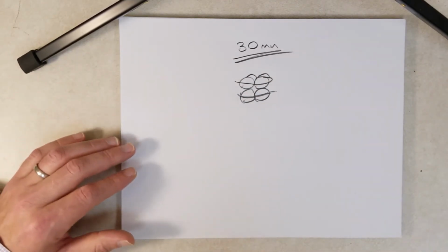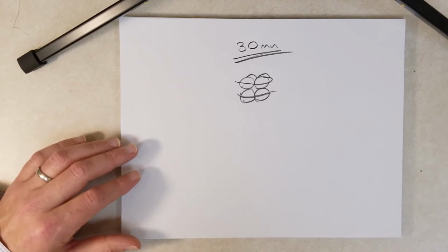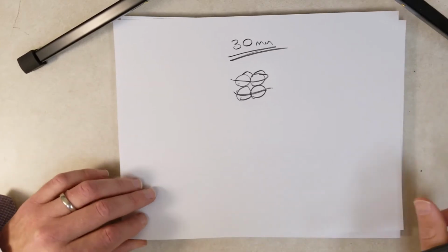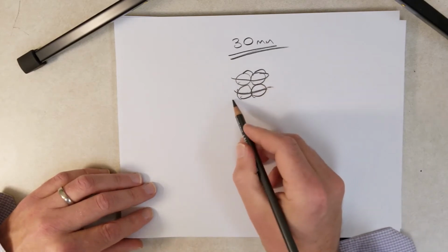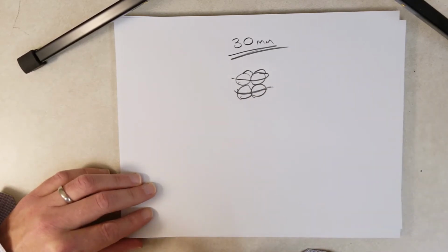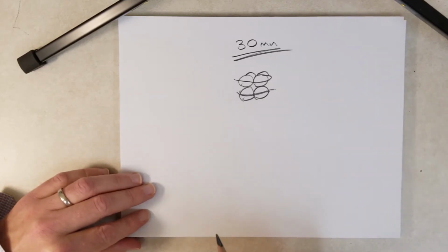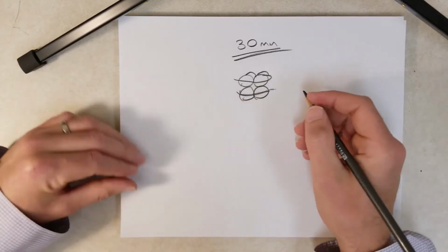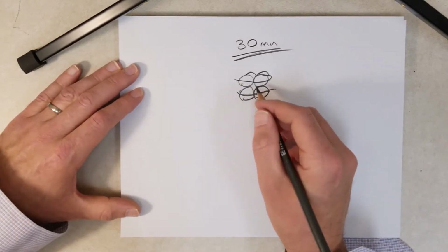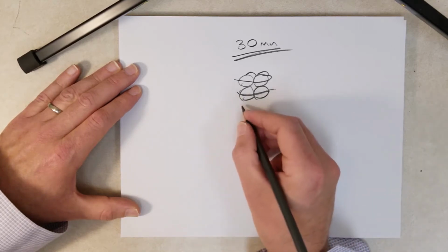Okay, so that's essentially how micrococcal nuclease works. But what can we do with that? What we need to do is get the DNA after digesting it with micrococcal nuclease, and then we can check the sizes of that DNA by gel electrophoresis. So for instance, with this thing right here, what's the best way to explain this?